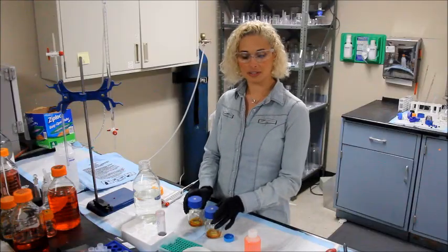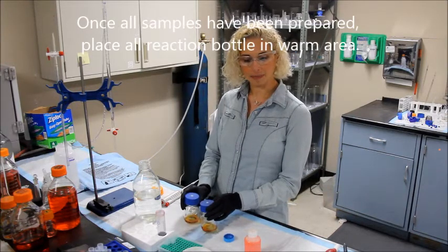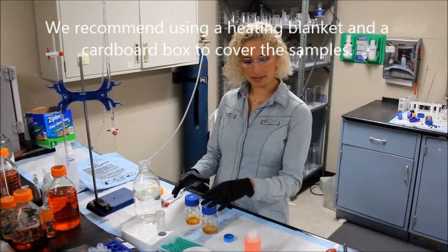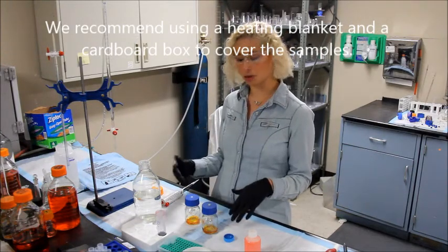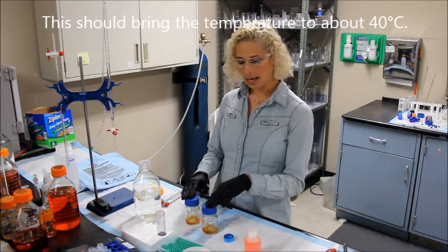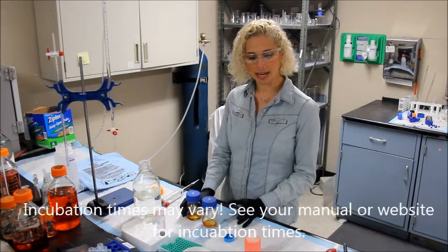Place all finished reaction bottles in a warm area. I'm going to be using a heating blanket and cover the reaction bottles with a cardboard box. This will bring the temperature inside the cardboard box to about 40 degrees Celsius. Then I'm going to allow the samples to incubate for about 12 to 18 hours.